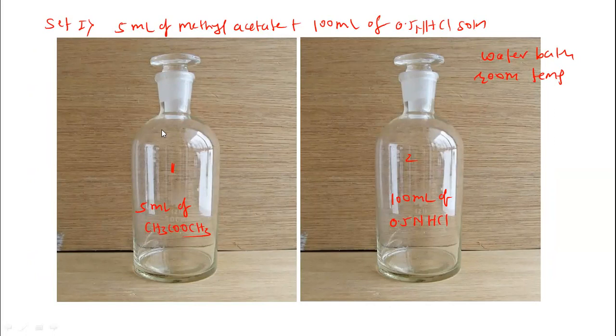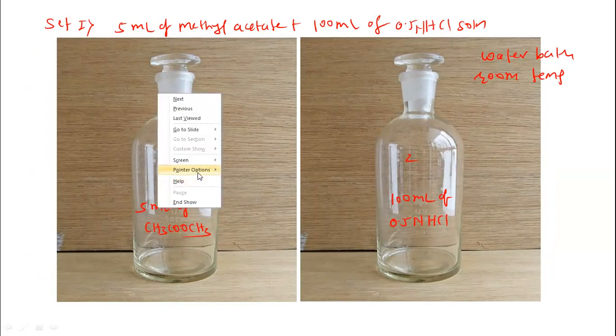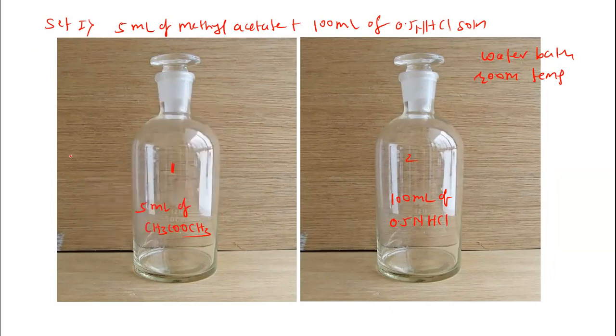So in that time, we have to take the burette, and we have to fill the burette with 0.1 normal sodium hydroxide solution. The burette solution is 0.1 normal sodium hydroxide.